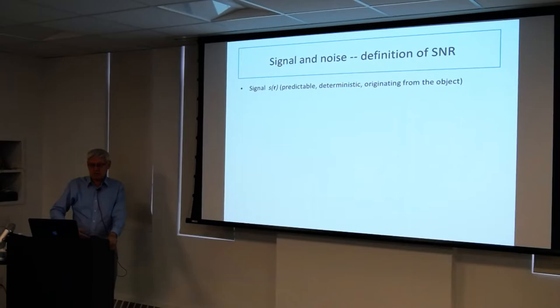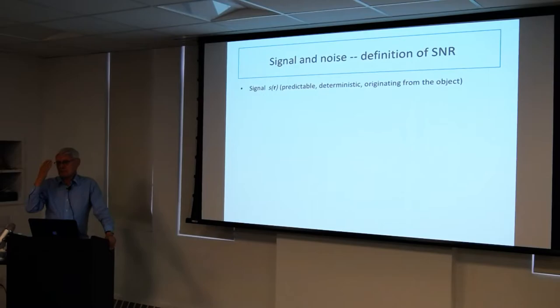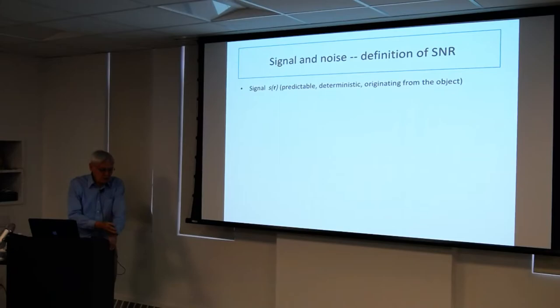It's a kind of programming that doesn't require knowing the exact code, because each operation has a certain conceptual meaning. So with these kinds of programs, you can put an entire edifice together, an entire workflow, and experiment with it. You can instruct yourself on what certain operations are actually doing, what they accomplish. And all these capabilities are lost now. So I'm trying to revive the modular systems, and at least they are a very good instructional tool.